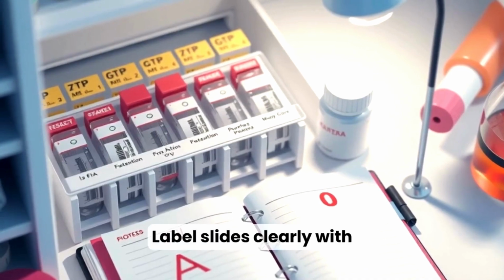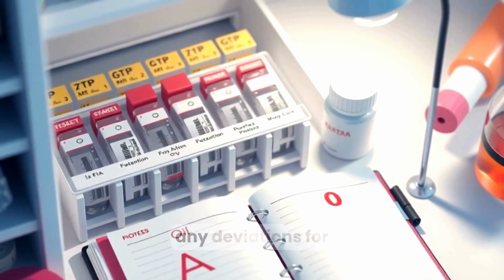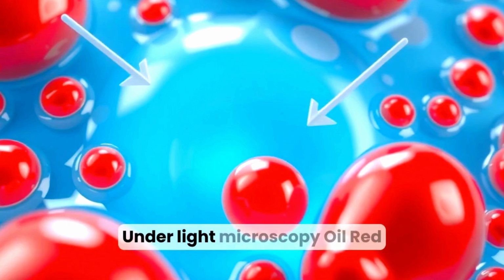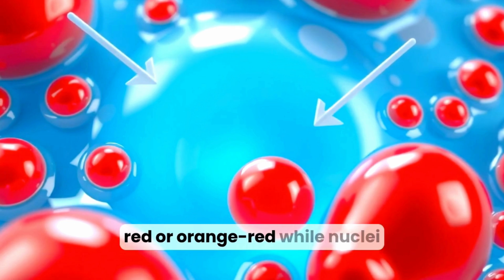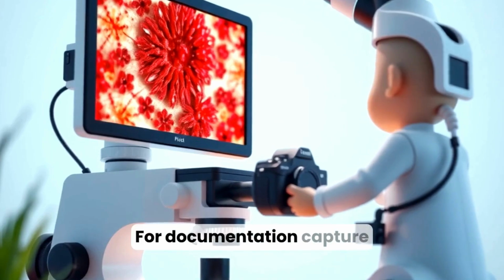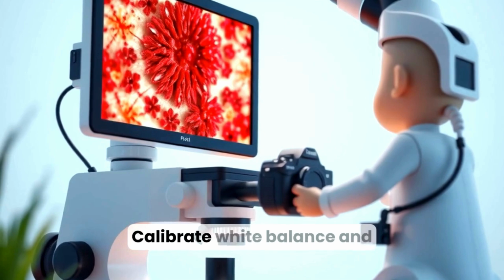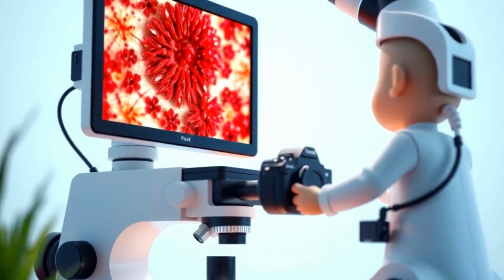Label slides clearly with sample ID, date, and protocol used. Document stain batch and any deviations for reproducibility and quality control. Under light microscopy, oil red O positive lipids appear vivid red or orange red, while nuclei and cytoplasmic background remain counterstained blue or purple. For documentation, capture images at consistent magnification and illumination. Calibrate white balance and exposure for reliable comparisons between samples.